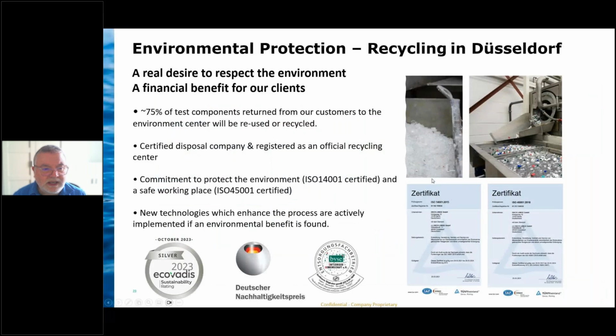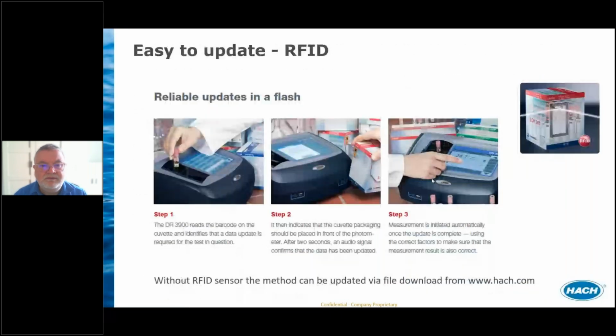I forgot to say that if you do not have the RFID sensor on your instrument, because it's an optional feature, you will be able to update via a file download from HACH.com.